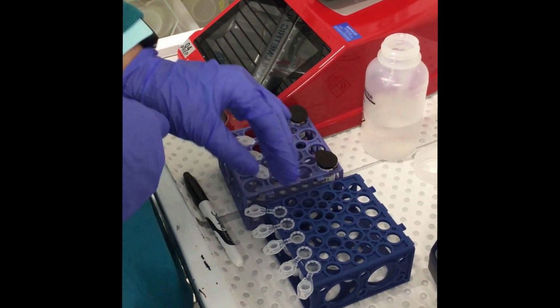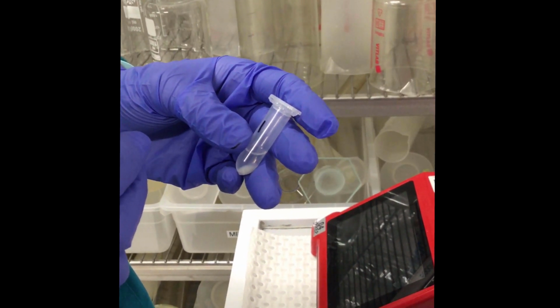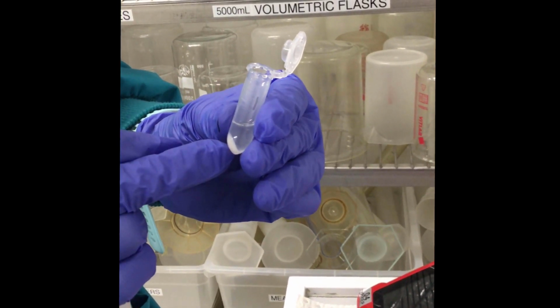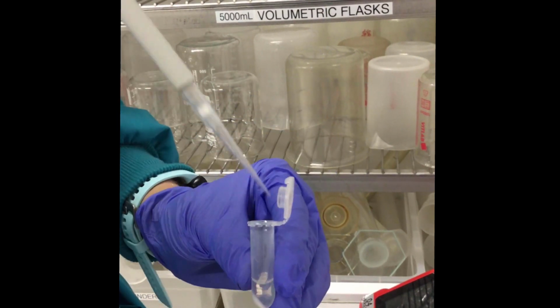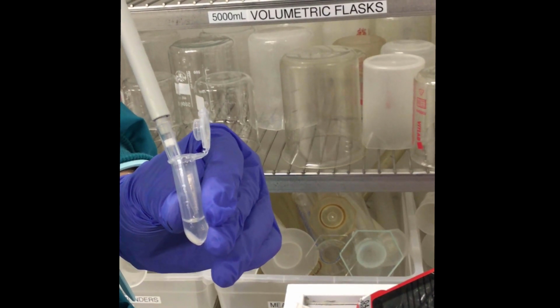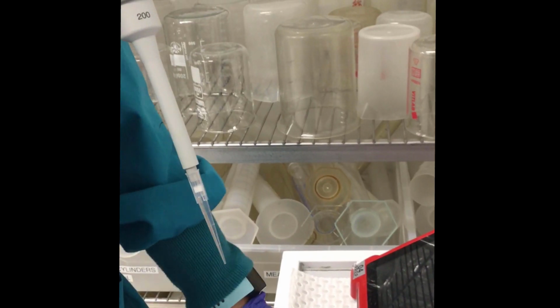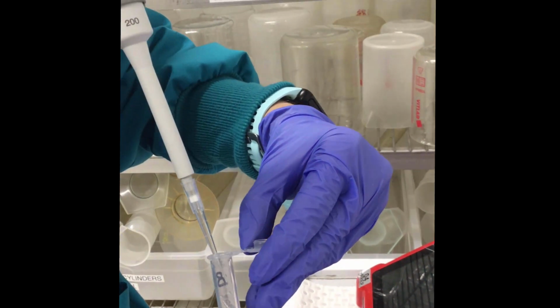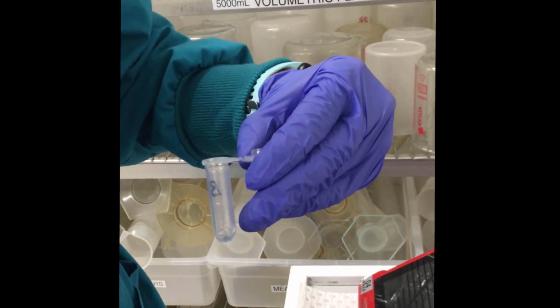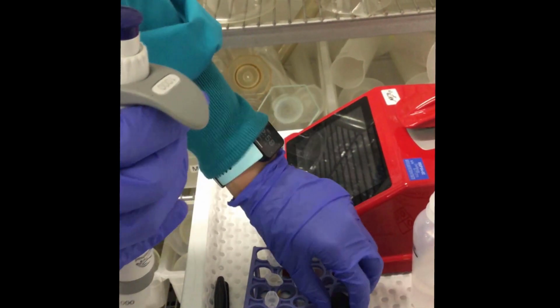The next step in the procedure is to assay duplicate lots of 0.2 ml samples. Now, when you're pipetting the supernatant, you need to make sure that you're not disturbing the pellet. Okay, we're going to take 200 microliters or 0.2 mls, and I put it in another Eppendorf tube. We're then going to add 500 microliters of our copper reagent.